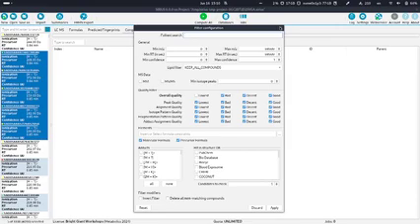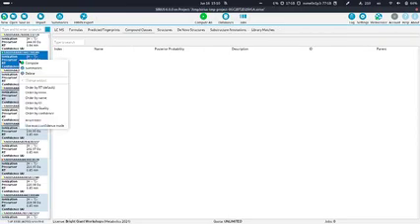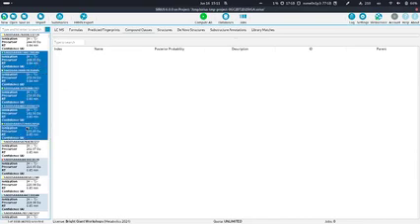I think it's even possible if we just right-click on a specific compound. There's also an option to just delete it. So you can also select some compounds and delete them completely from the project space. And as I said already, we are now in this temporary project location, so everything we do will be automatically saved to this project location. Okay, back to the compute dialog.